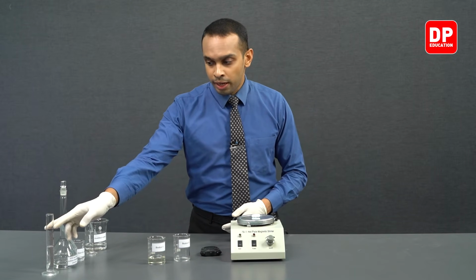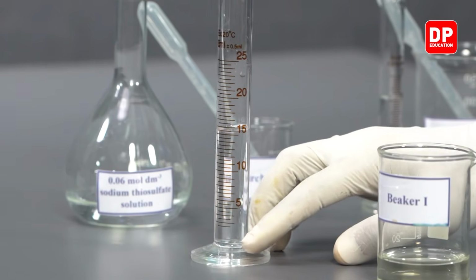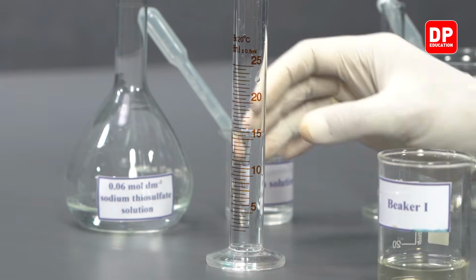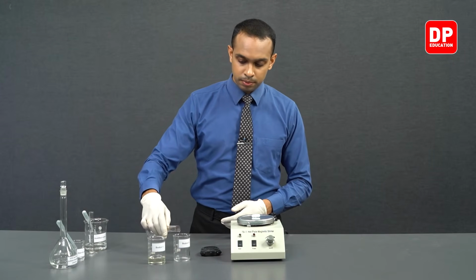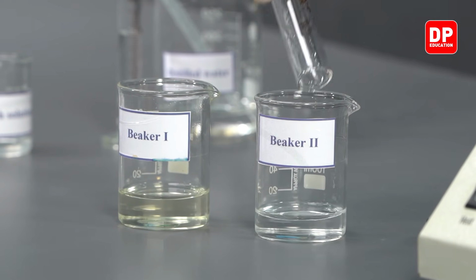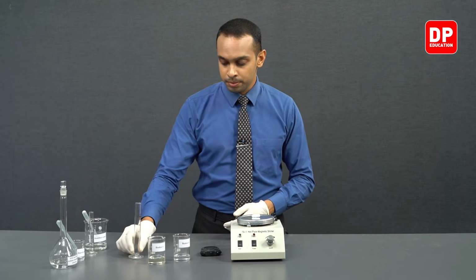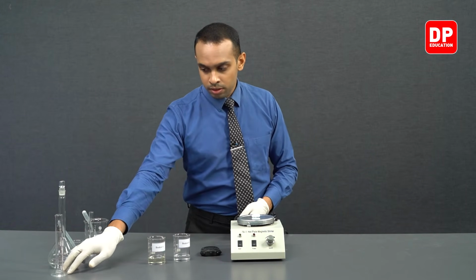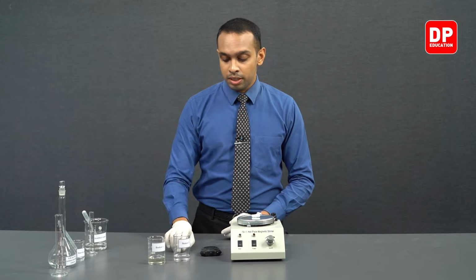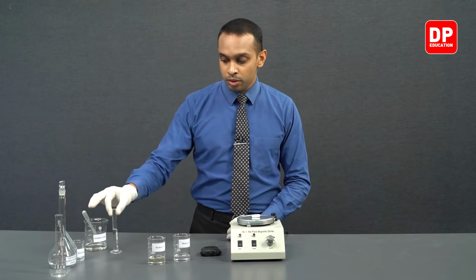And into beaker 2, like we did in the previous instances, we are going to add 15 milliliters of sodium thiosulfate solution. Now the volume in beaker 2 is 17 milliliters. And then to increase the volume up to 25 milliliters, we will be adding water.